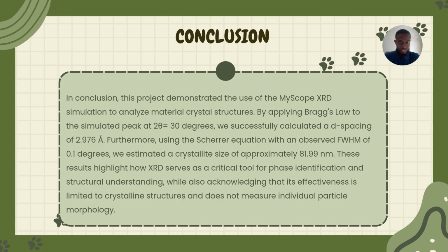81.99 nanometer. This result highlights how XRD serves as a critical tool for phase identification and structural understanding, while also acknowledging that its effectiveness is limited to crystalline structures and does not measure individual particle morphology.